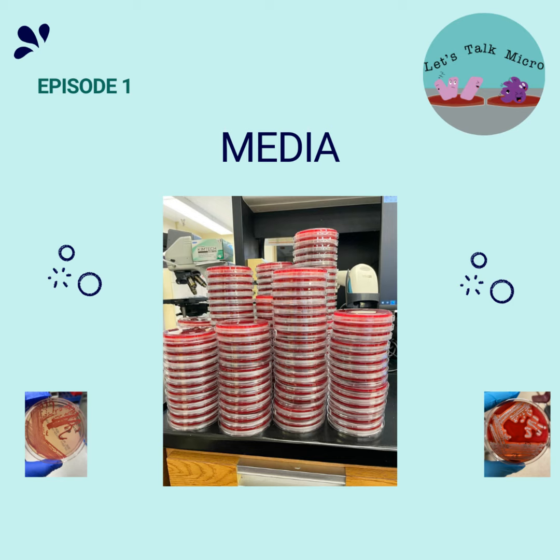Another great example of selective agar is PEA, phenylethyl alcohol agar. It is used for the selection of aerobic gram-positive cocci and bacilli. That is not to say that other organisms won't grow, but maybe somewhere down the line we'll talk about that. These are two great examples. They are included in your basic battery of cultures, and I will talk more about this. But definitely blood, PEA, and MacConkey.